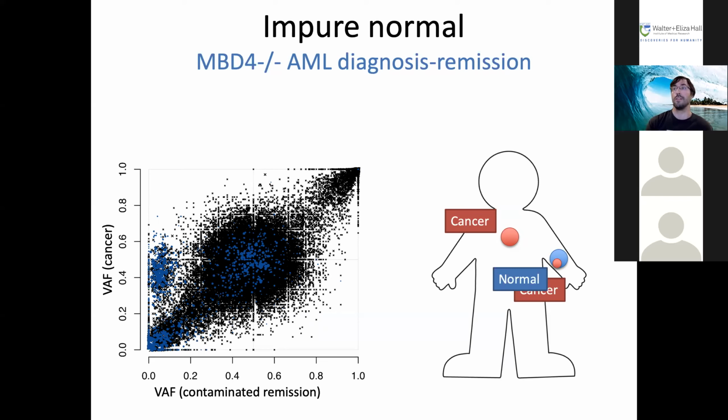You just look at the scatter plot and you see, oh, wait, the somatic variants have separated a bit. It seems like we have a problem with cancer contamination in the normal. And if you run a somatic variant caller, and this depends a bit on which method you're running, you may miss a lot of the variants depending on how picky the method is with excluding variants that are too much present in the normal.